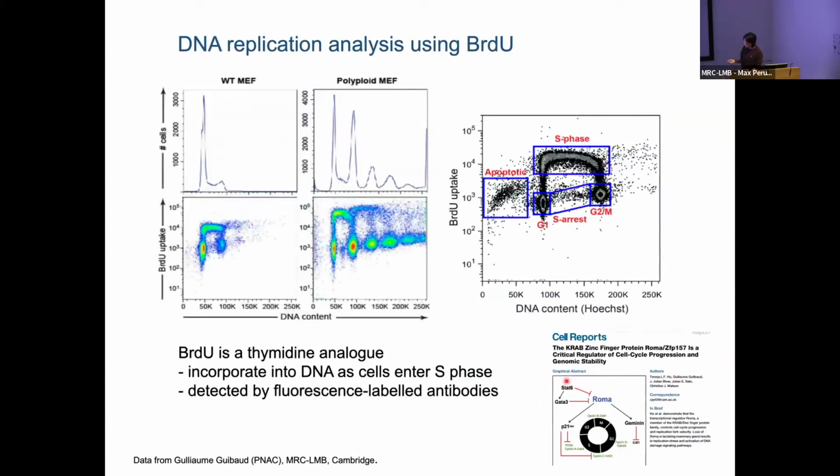In the cell cycle, we can pick out S phase particularly. So Guiyang from the Sales Lab gave a very good example of how to analyze the S phase within a cell cycle. They use BrdU. BrdU is a thymidine analog that can be incubated with the cells. The BrdU is incorporated into the genome. Later on, the BrdU can be detected by an anti-BrdU antibody.